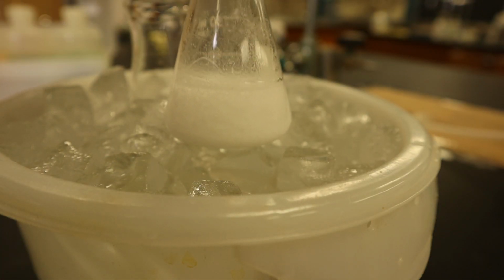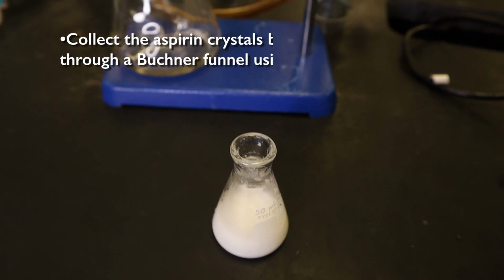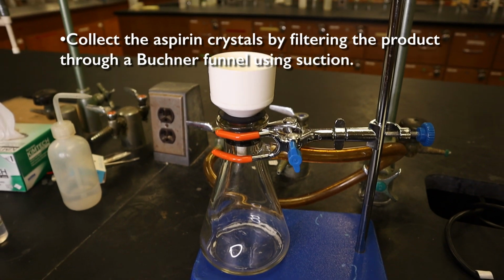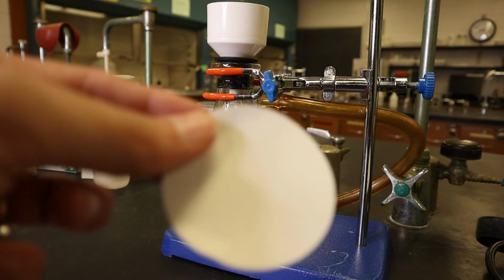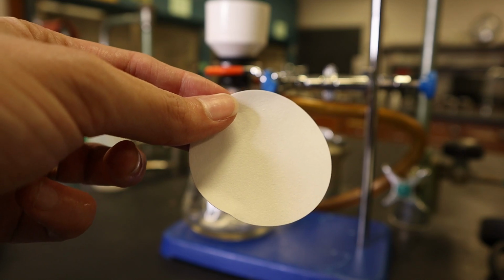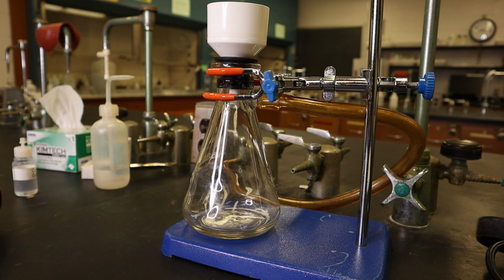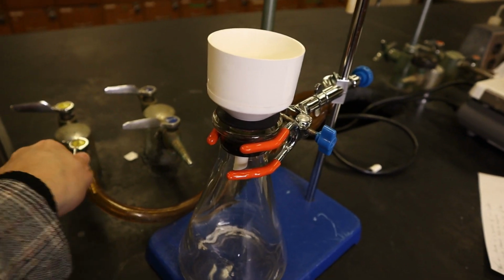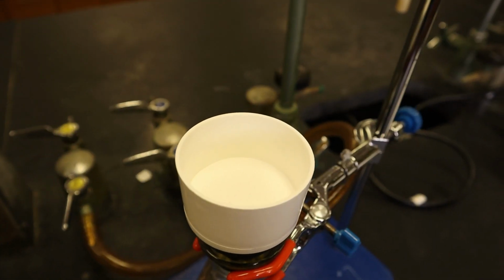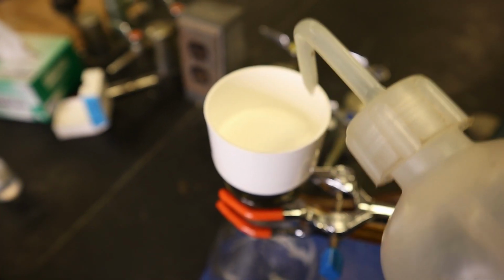We're going to get our crystals by filtering our product through this Buchner funnel using suction. We're going to be putting in this filter paper to avoid losing any product. We're going to add some deionized water on the edges to make sure that it's suctioning right.